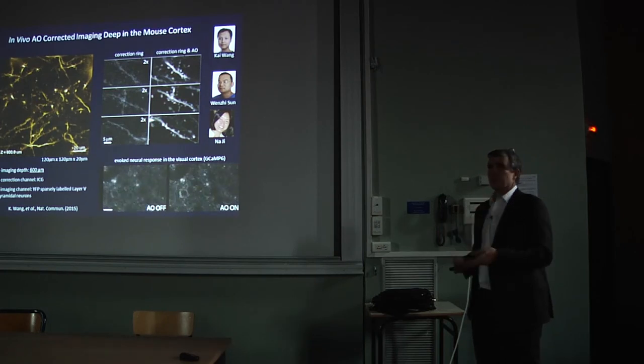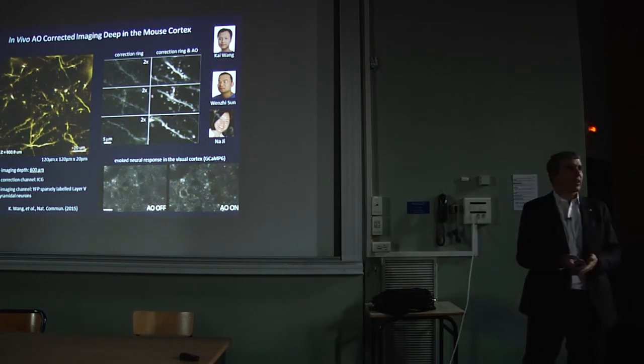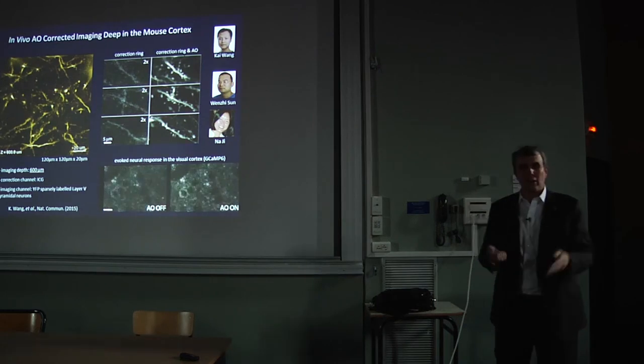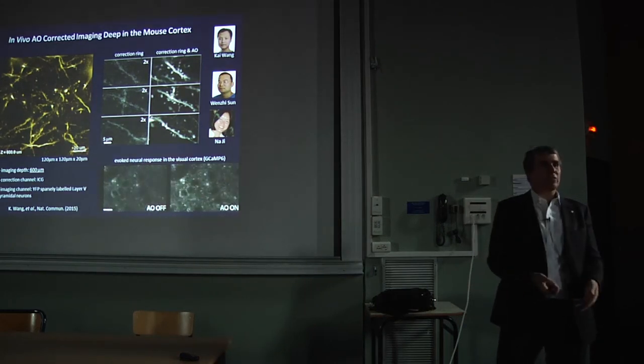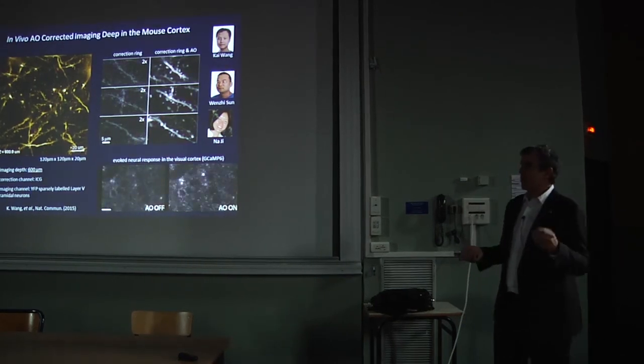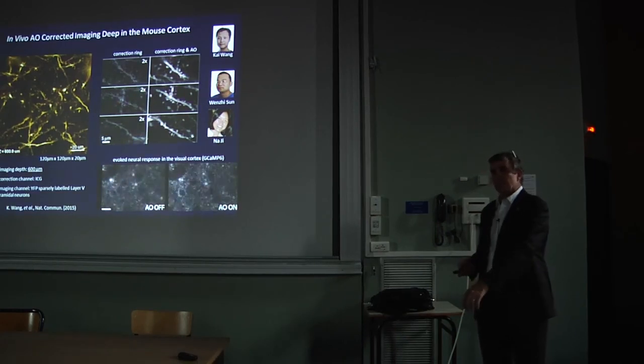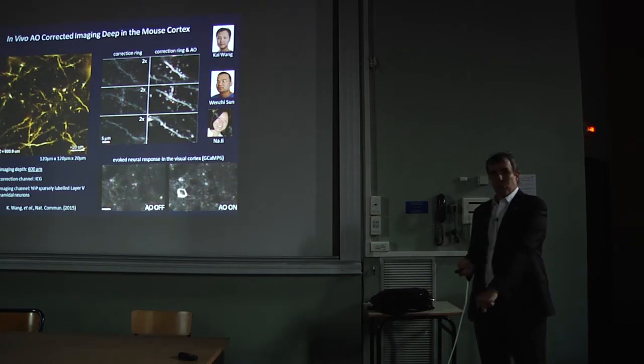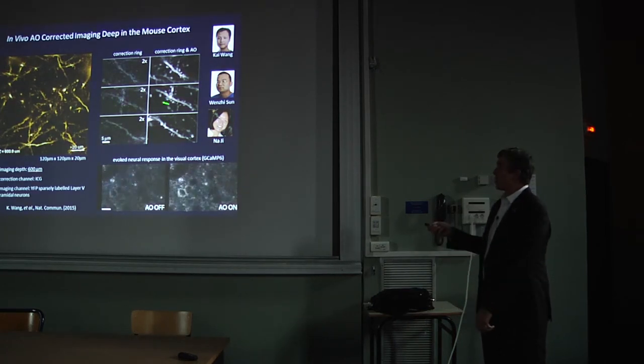So that's why people use 2-photon microscopes, because they have infrared light that can penetrate more deeply. So what we do in that case is that we either use an infrared dye or co-transfect with an infrared fluorescent protein, and then we can use an infrared guide star, which isn't as scattered, still be able to see that at great depth in the mouse brain, all the way through the mouse cortex, and then still get spine resolution with the adaptive optics.